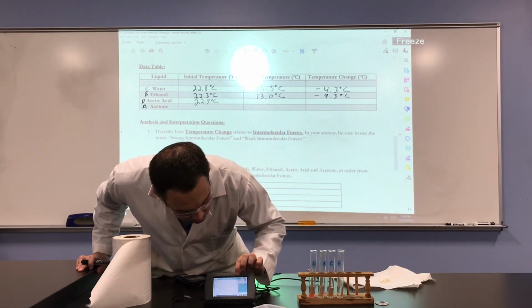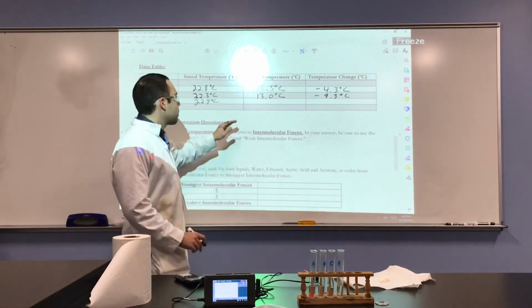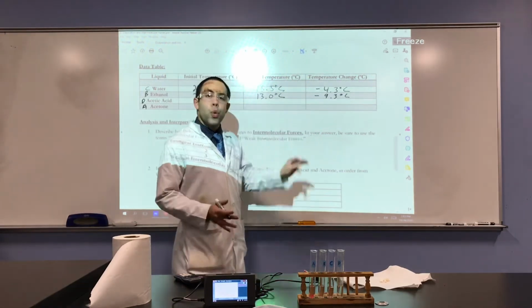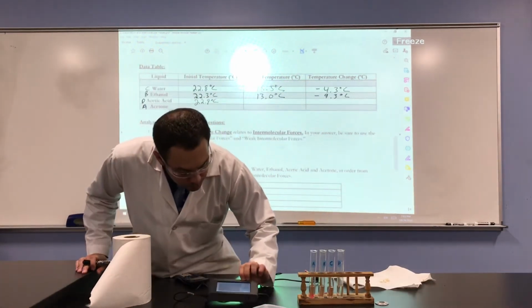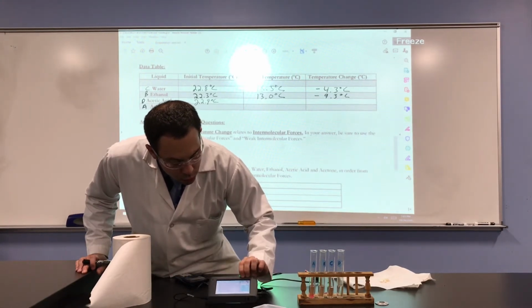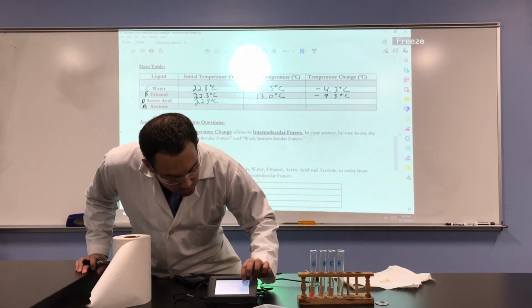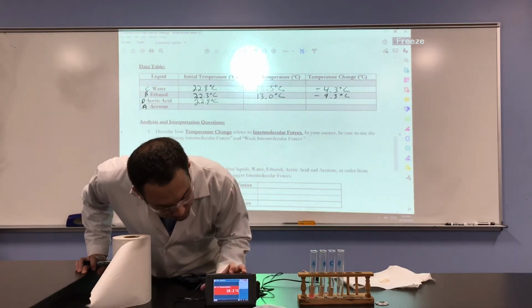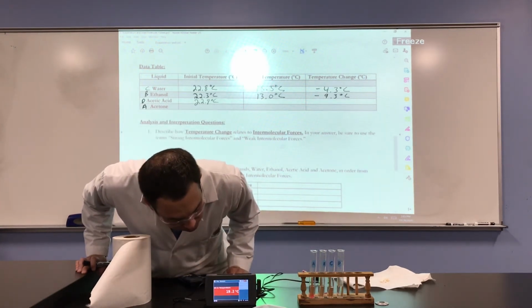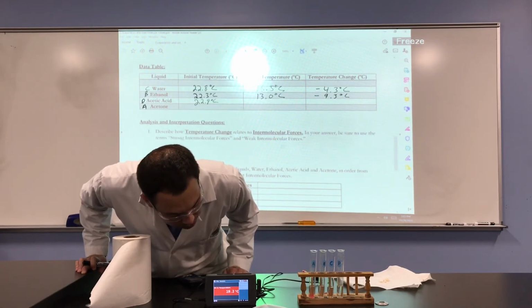We're at 130 seconds, so we have 50 seconds left. So keep that in mind. The greater the temperature change, the weaker the intermolecular forces. We're at 147 seconds, so about 30 seconds left. We are at 19.1, 19.2. 19.2, 19.3.